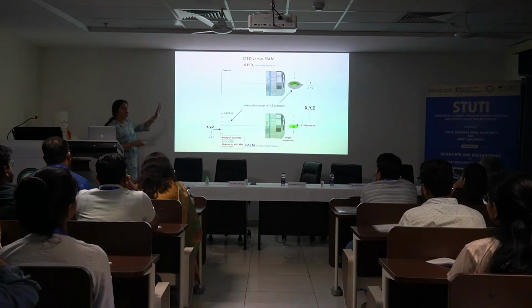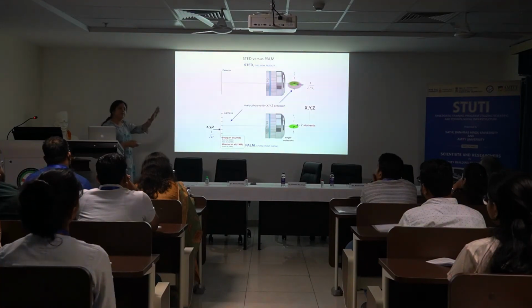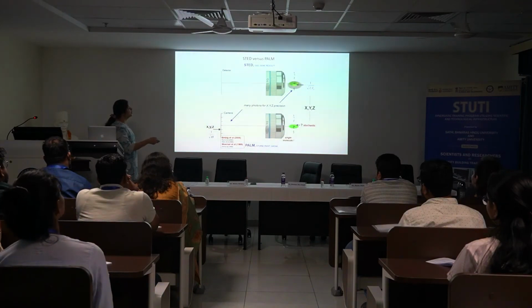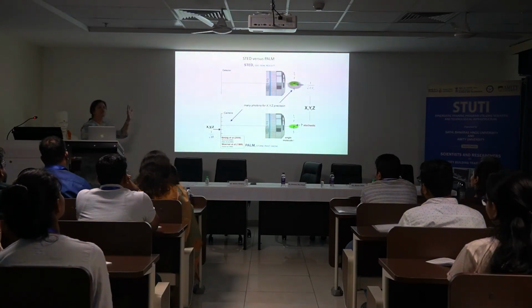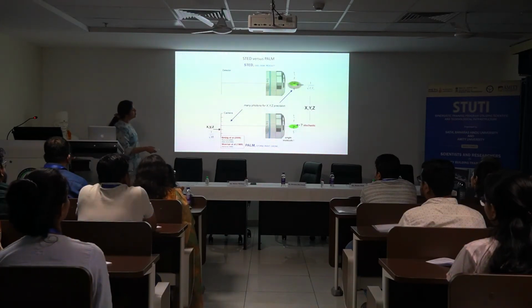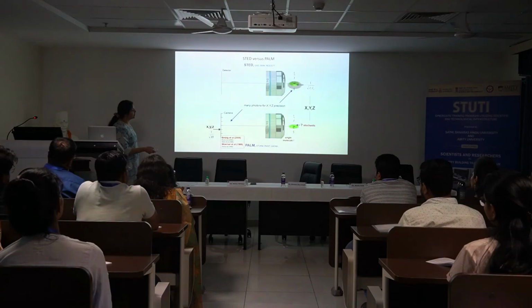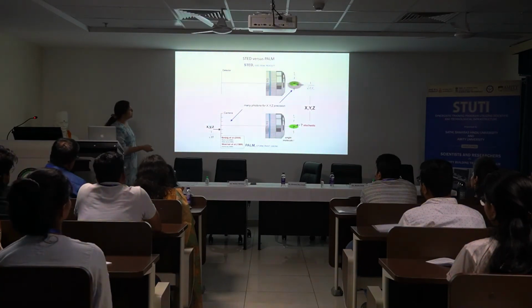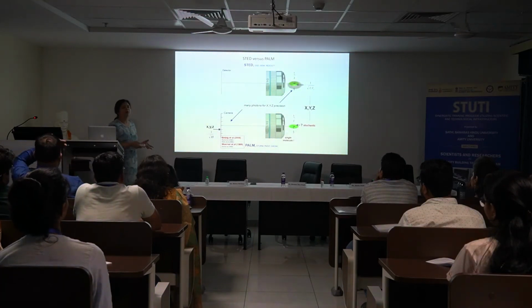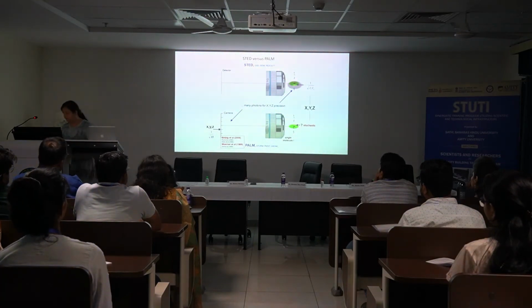Since this is being done sequentially in the sample, hopefully you noticed when you're looking at the demo sessions, you don't have a problem of localization. The light is coming from wherever it is placed there. Whereas in this case, the activation is taking place in a stochastic manner. So you have to do this again and again till you have saturation of activation in a particular sample, because that's the way of localizing, right?